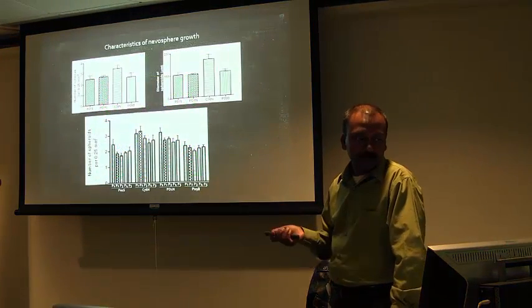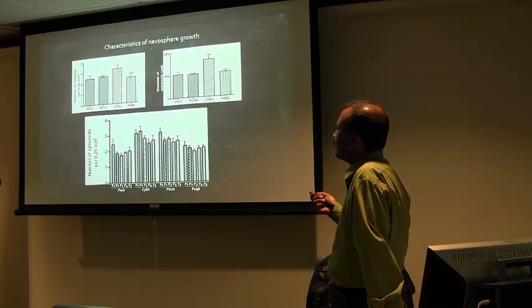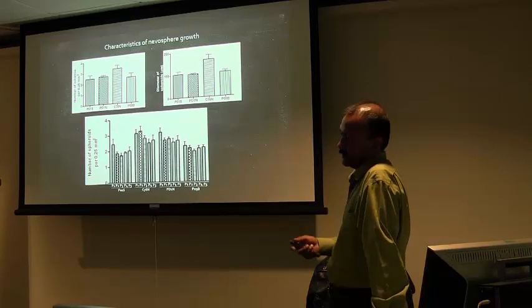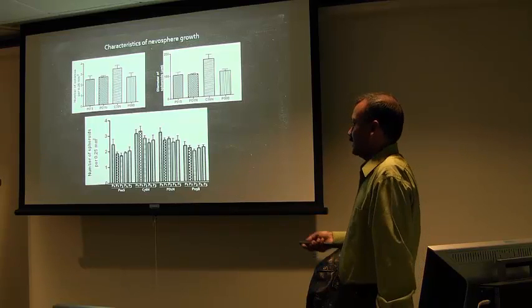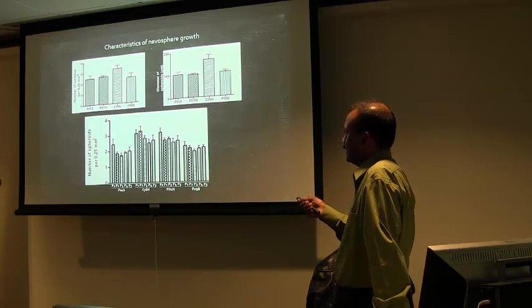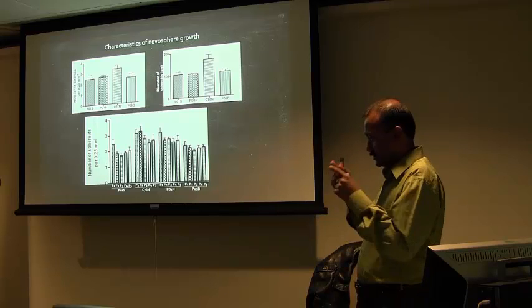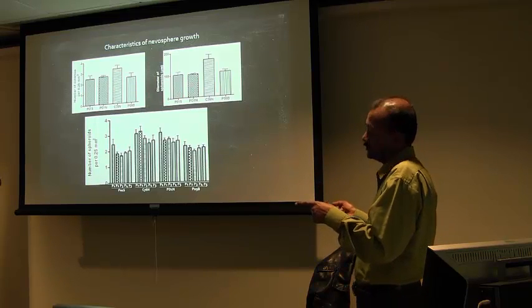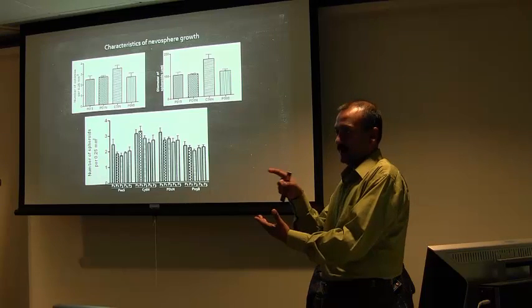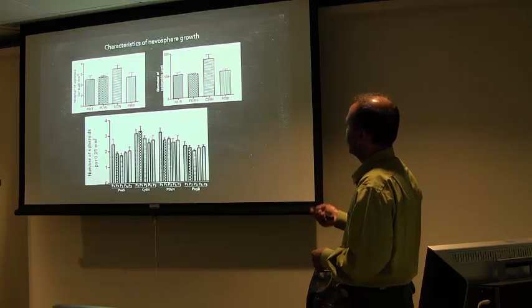We can actually count the number of spheroids. So we can compare the number of spheroids present in each patient's sample, and it has perfect correlation with the aggressive, proliferative ability of the cells. These cells grow faster, more aggressively in culture, so definitely they generate more colonies than the other three. Also, we can measure the diameter of the spheroids using software in microscopes. You can put the spheroid colony under the microscope and measure the diameter of the spheroids in micrometers.